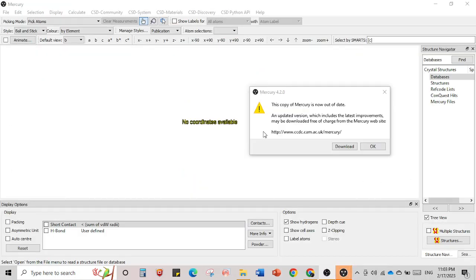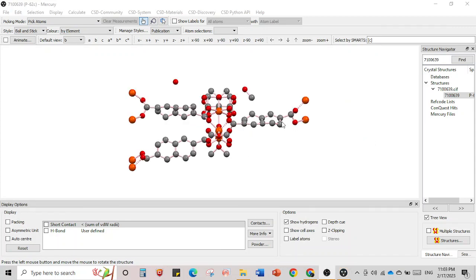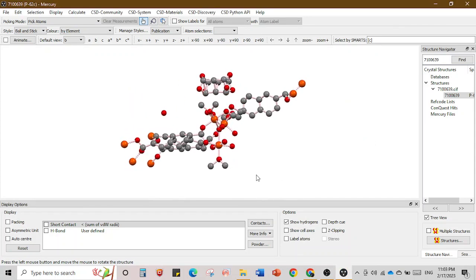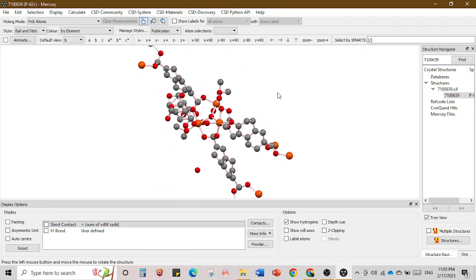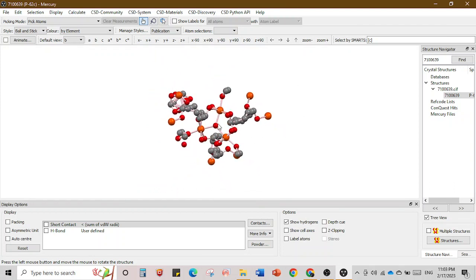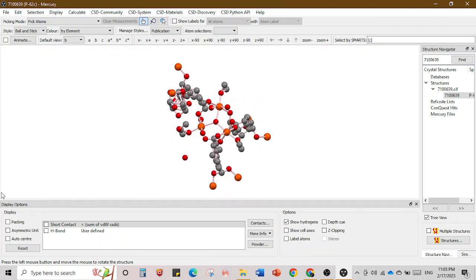Now we have our system open in Mercury. When you first open it, a pop-up window says 'this copy of Mercury is out of date' — you can upgrade or just say okay. Now our data is loaded and this is our single unit cell. As I said before, you can see the mu3 oxygen where one oxygen is connected to three metal centers.